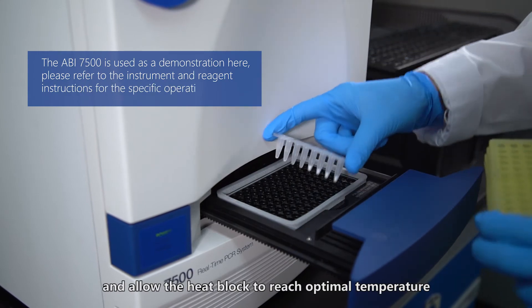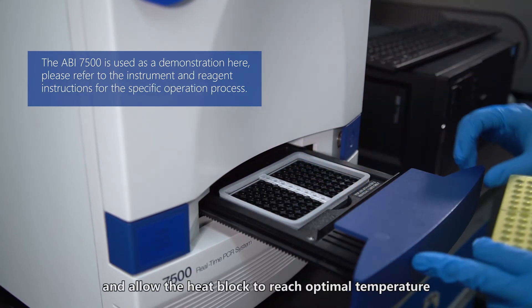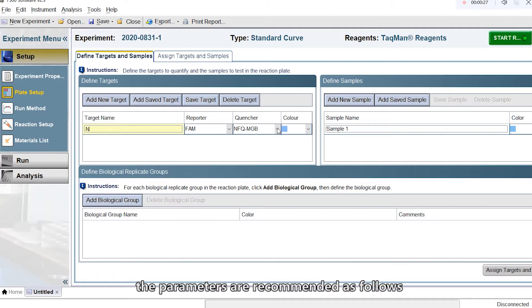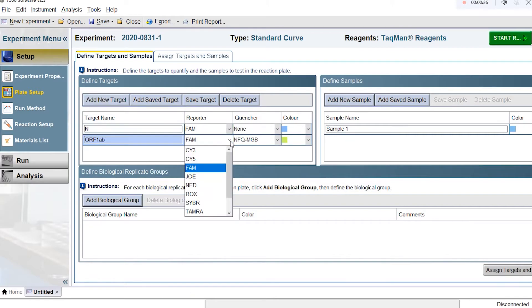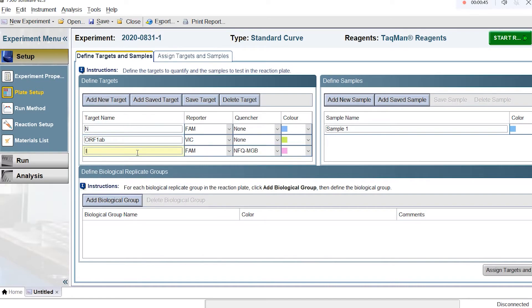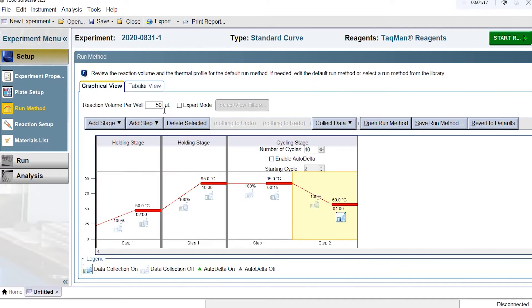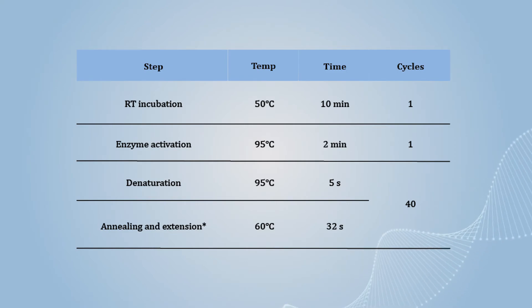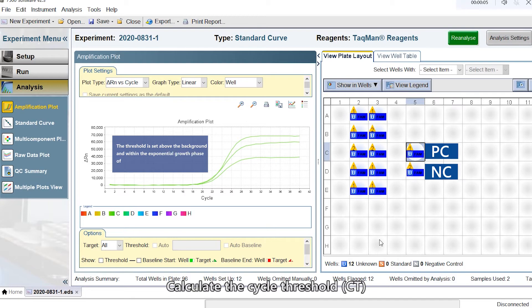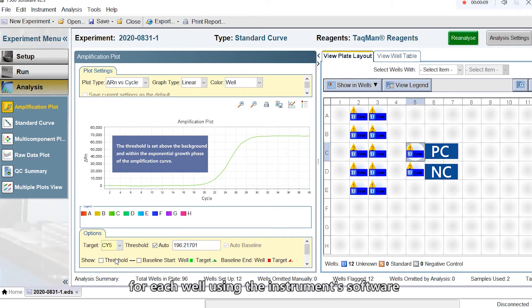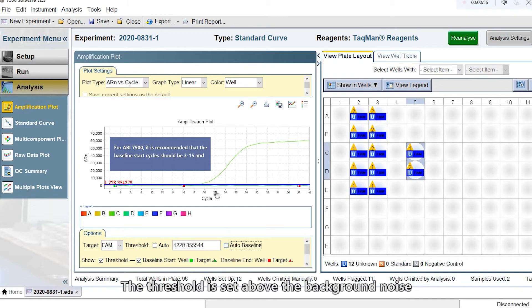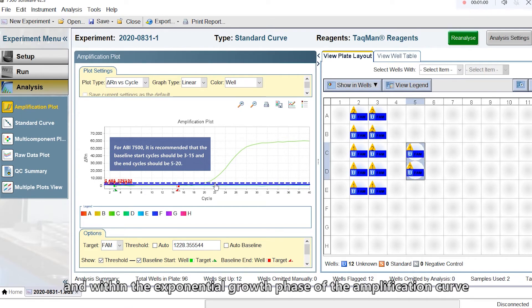Turn on the PCR instrument and allow the heat block to reach optimal temperature. Taking ABI 7500 as an example, the parameters are recommended as follows. PCR cycling parameters are set accordingly. Calculate the cycle threshold CT for each well using the instrument software. The threshold is set above the background noise and within the exponential growth phase of the amplification curve.